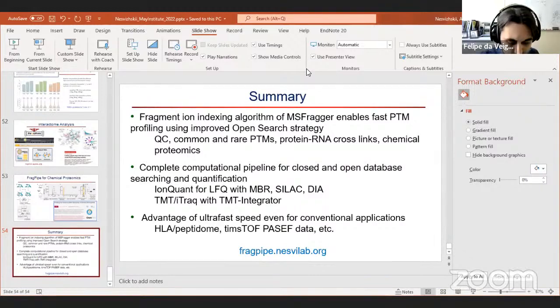First, we're going to demonstrate how to find our tools and programs on the internet, how to work with the websites, how to download them. Then we're going to show how to configure FragPipe using a simple DDA TMT MS3 experiment, how to operate the program, how to put all the parameters in place, and then we're going to go through the output files and explain how you can use them.